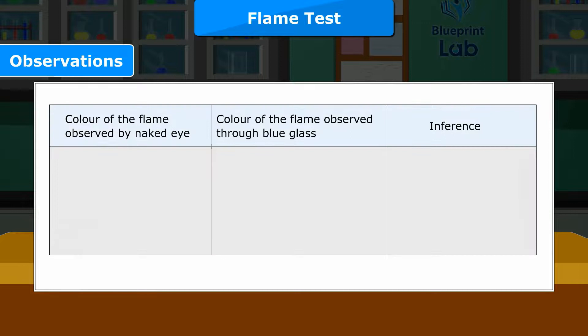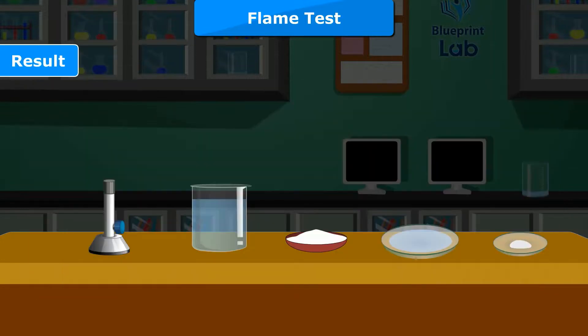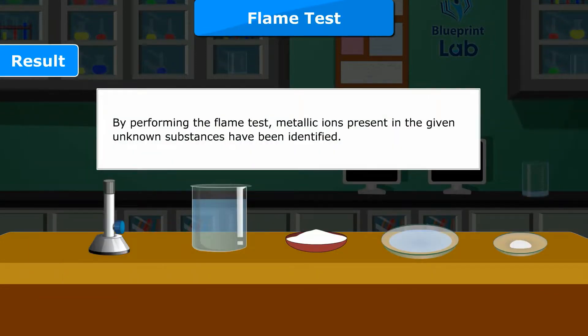Observations — Color of the flame observed by naked eye and color observed through blue glass. Inference: Golden yellow / Invisible → Sodium (Na⁺). Lilac / Pale violet → Potassium (K⁺). Brick red / Light green → Calcium (Ca²⁺). Result: By performing the flame test, metallic ions present in the given unknown substances have been identified.